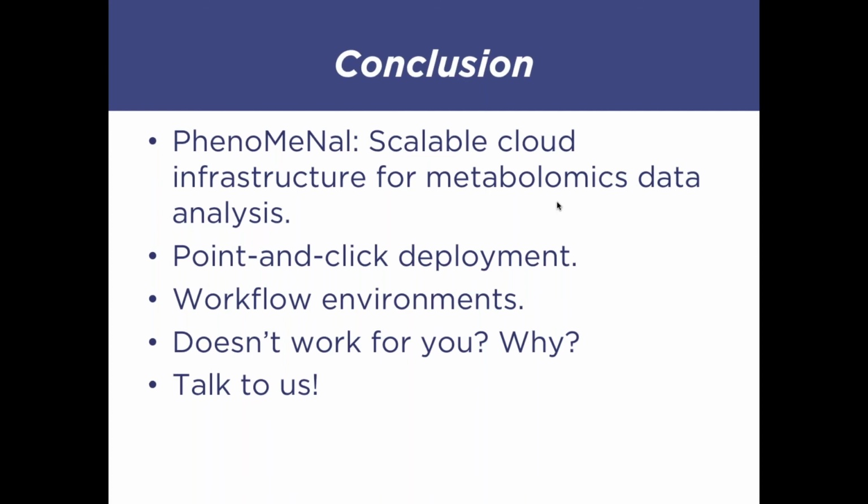There's another question asking, can we create a cloud research environment on PhenoMeNal without using Amazon? Yes, you can, provided that your institution has a private cloud provider. If your university or research institute has something like OpenStack installed, then you can use our deployment setup to create the same PhenoMeNal cloud research environment on your local OpenStack setup.